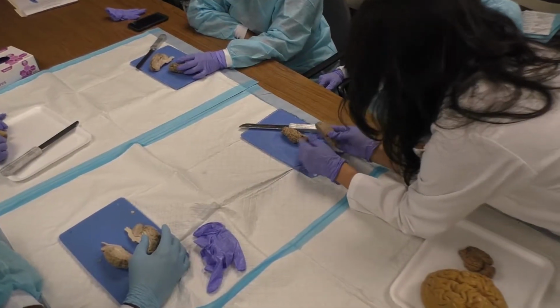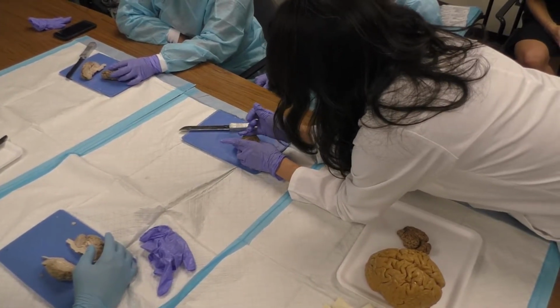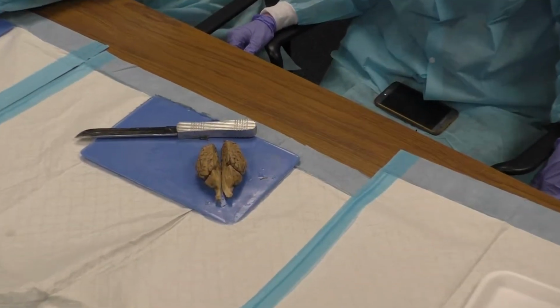Next, I want to do a little bit of dissection. First, some coronal sections, and then I want to dissect out the hippocampus as the pièce de résistance. Okay, so let's do that.